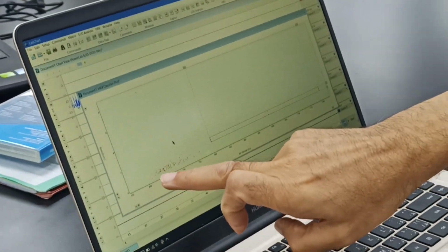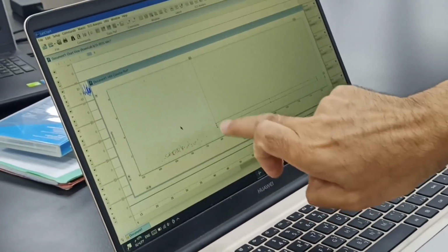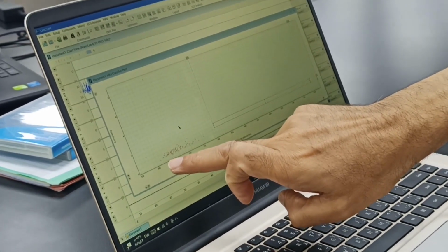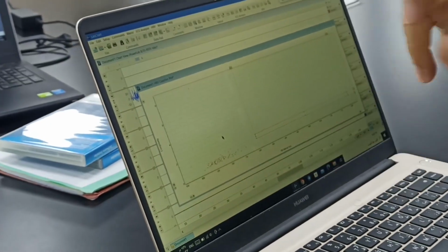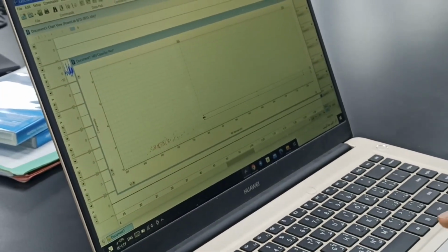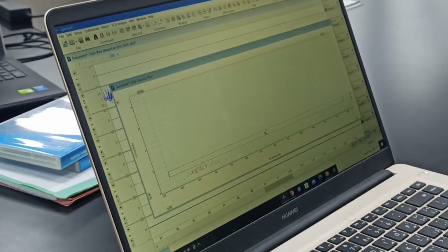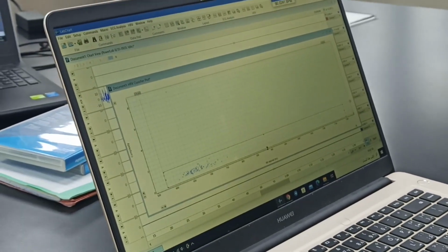So what this software is doing, it is giving us all the beats here which we have outlined in this particular area, spanning from about 610 millisecond to 760 millisecond. Okay, so these are all crosses basically. Now, this is a frame that will include all these into calculations.